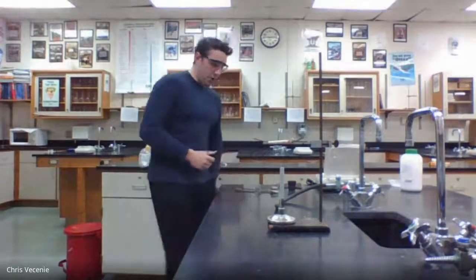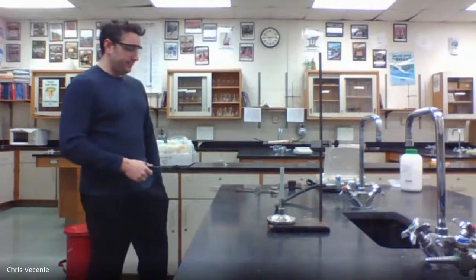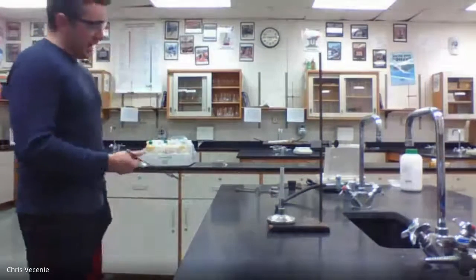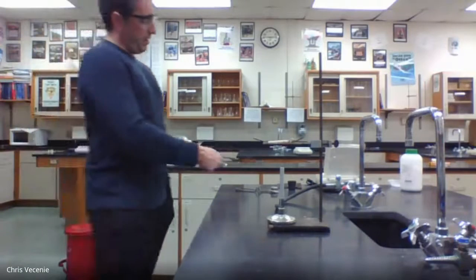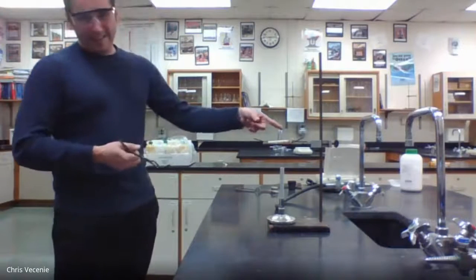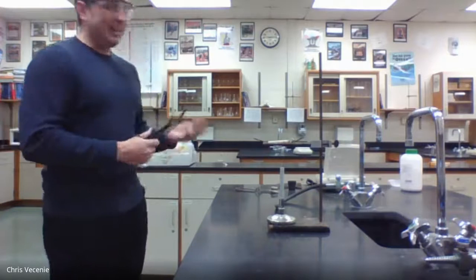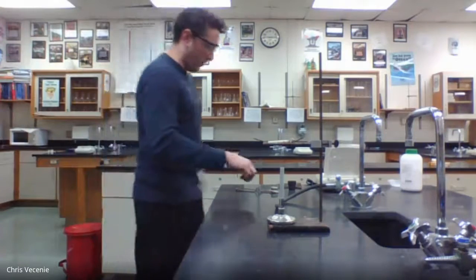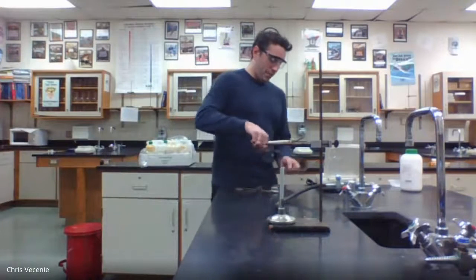Let that cool for just a moment. Why we need to let that cool is, as crazy as it sounds, if I put that really hot crucible on the balance too fast, it heats up the air underneath that plate, and hot air rises. So it will lift that dish just a little bit and I will get an artificially low weight. So we have to let it cool so we can't superheat the air underneath and make a convection current, is what that's called. So we let that cool for a minute.